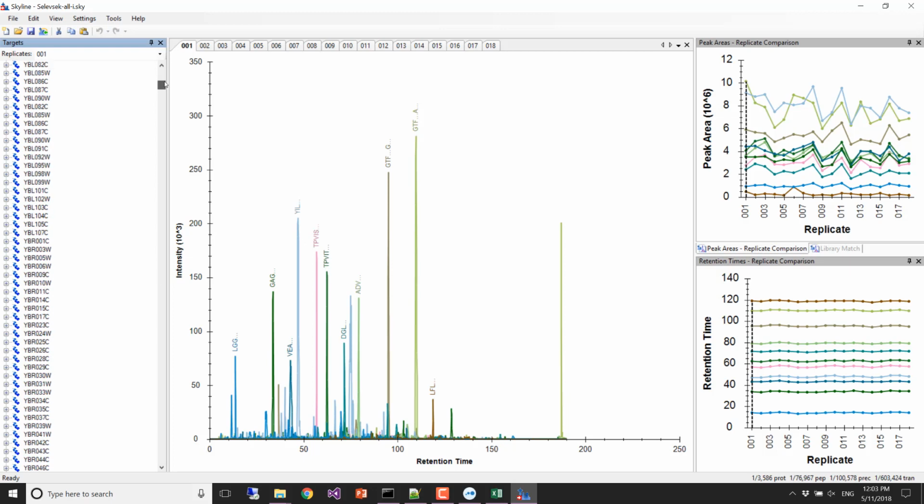on the unrefined data, do the statistics on refined data, and make some Venn diagrams of what you call statistically significant in one case or another. Right? It seems like there would be two circles that would be somewhat overlapping, but there would be things called significant in the refined data because of the reduced multiple testing issues, and there might be things called significant in the unrefined data that wouldn't be there in the refined data because you picked them up, right? So I'd like to see those.